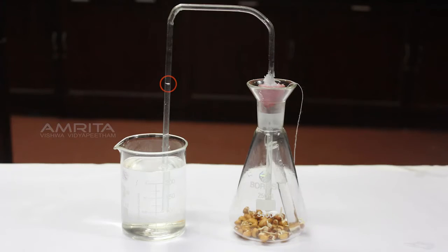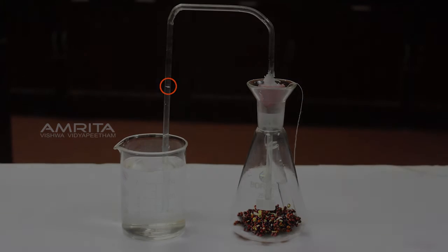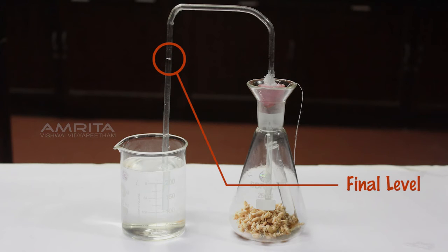Observation. After 2 hours, you will see that the level of water has risen in the delivery tube at the end dipped in the beaker of water. Note this level as the final level.